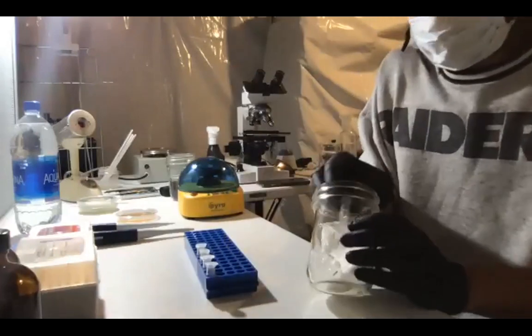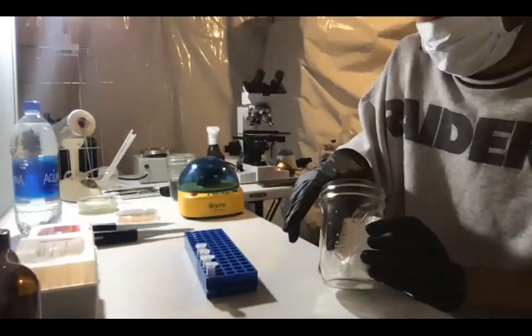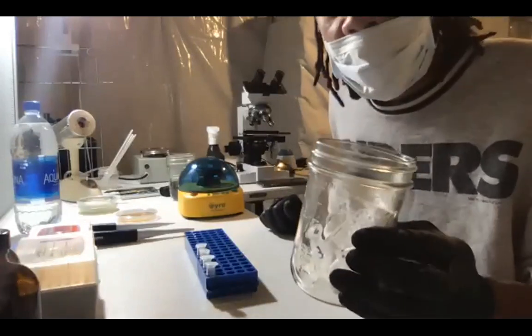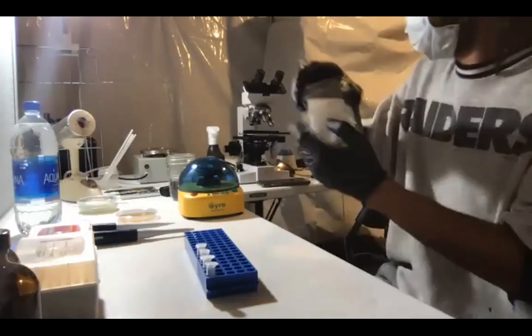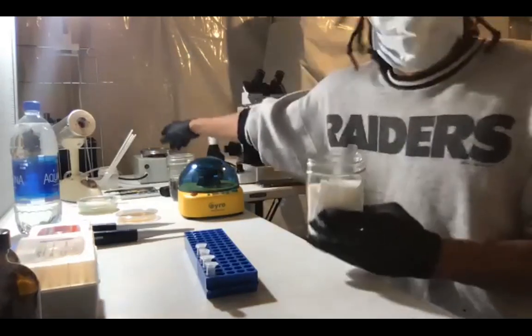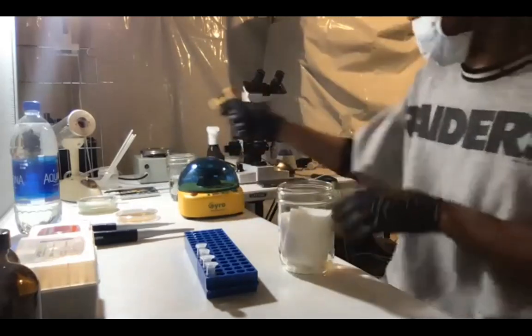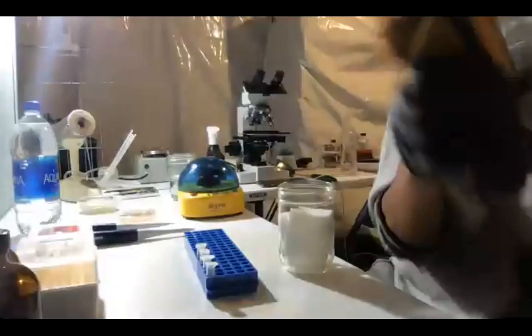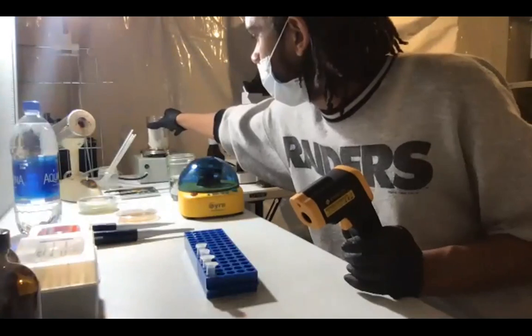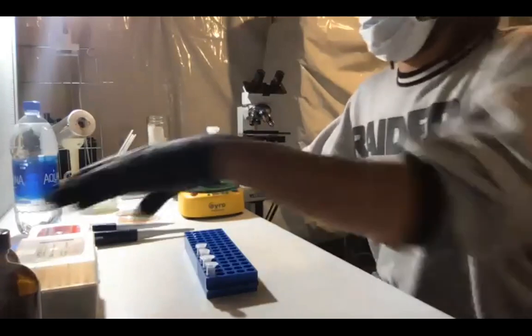If you have a heat block, definitely use your heat block. If you can invest in a heat block, it's definitely worth the investment. You also need to be careful because when these get hot, they might pop open, so try your best to avoid that. All right, so my magnetic stir bar is right over here. It's hot. Right now it's at 53 degrees Celsius. It's going to just keep getting hotter. So I'm going to set these on here and slowly that's going to get hot. That's going to take a little bit of time.